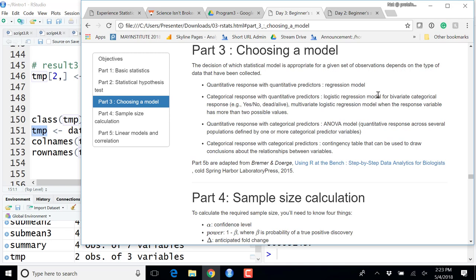So today, the data we are working on is IPRD, which includes log2 intensity by column. So mainly we compare log intensity by condition, right? We always use log intensity and condition when we plot, when we calculate, and so on.